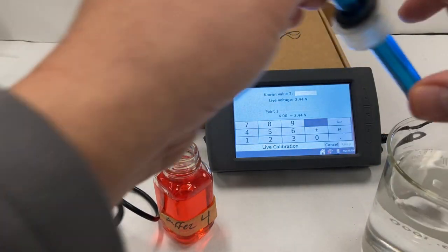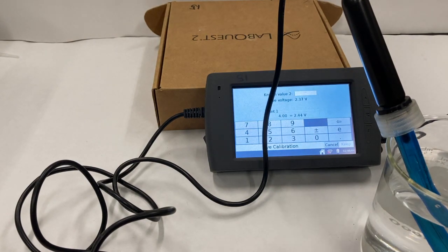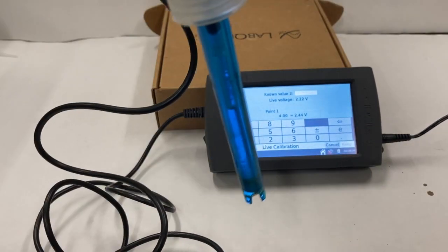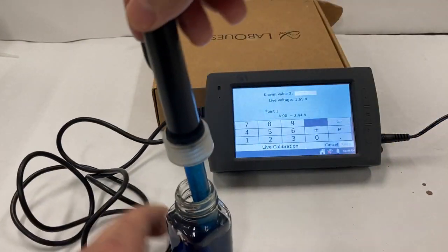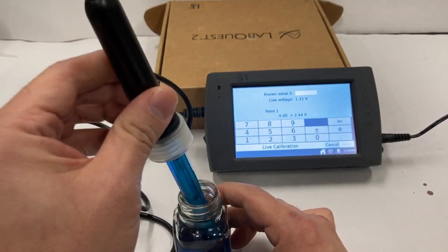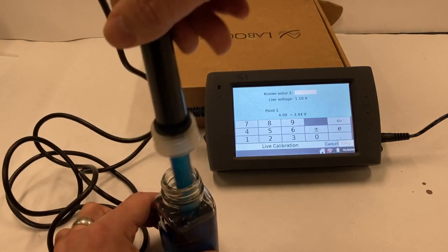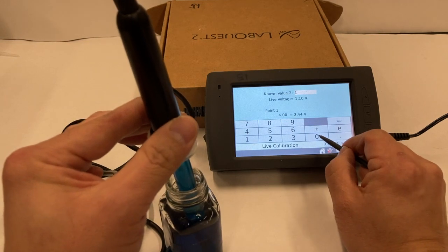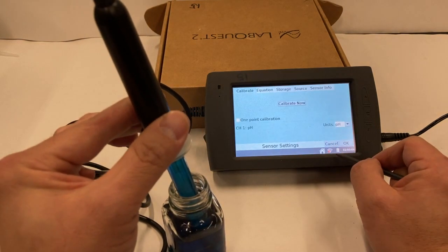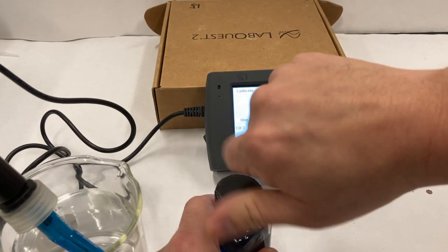All right, so I'm done with that buffer. And whenever we use a probe, we always rinse in between. So you should have a rinse beaker, deionized water, before we go ahead and place this in the pH 10 buffer. So let's swirl this in here, wait for that voltage to change, and hold steady. Well, anyways, I can type in what the pH is, and we're going to keep it. All right, I've entered both of my values, rinse my probe, and now we're ready to test.